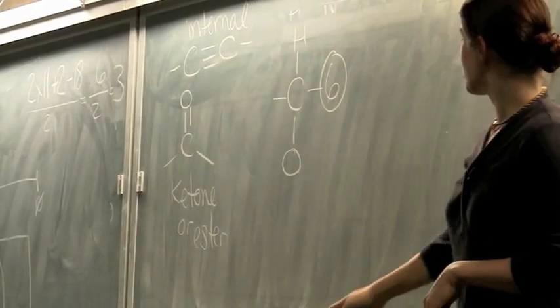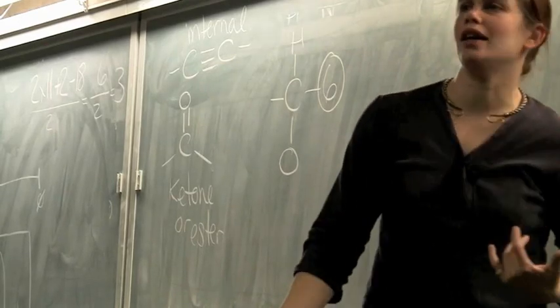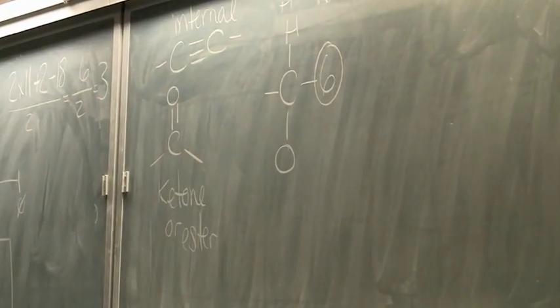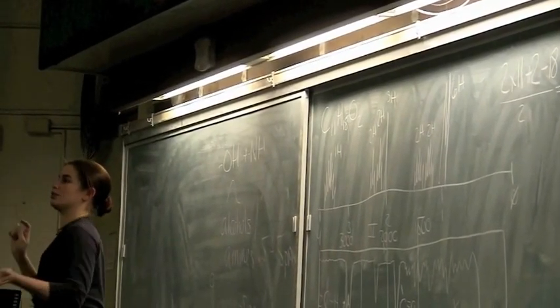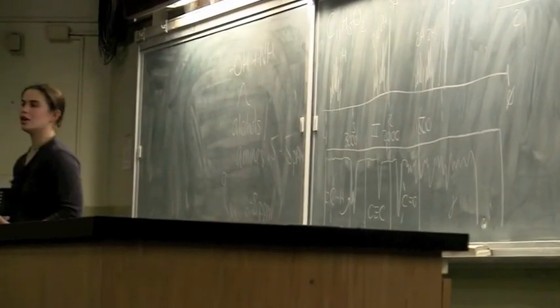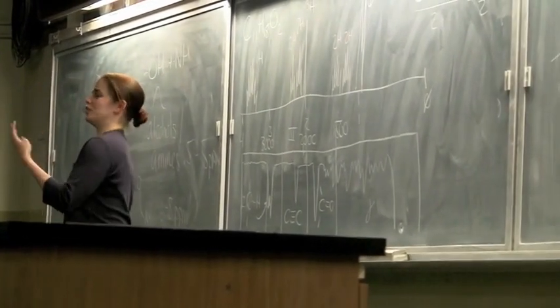Now, I use this sort of circled number indicator. That's just me. It's not that everybody has to do NMR that way. But what that tells me is I know there's 6 neighbors, but I don't know who they are. It's very tempting to just write down, I know there's 2 CH3s next to it. We've got 6 neighbors, we've got 2 places, they must be 2 CH3s. But if you don't know who those CH3s are, you write them down, then you find them, and all of a sudden you write them down again, you've got 4 CH3s.